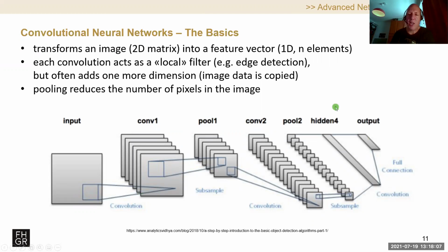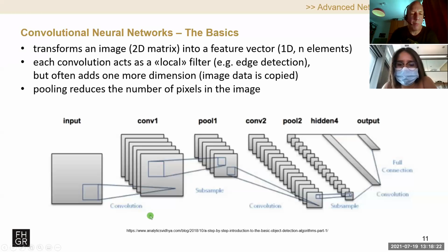We would have, in the end, somewhere here in the back, this classification layer. But before we can do the classification of what type of cell is being presented to the camera, we would first need to have a search strategy to look all over the image, find various regions or proposal regions, and then we would analyze all these regions. And in the end, for some proposal region, we would then do the classification and say, okay, right up here is something that is a blood cell or a neuron.